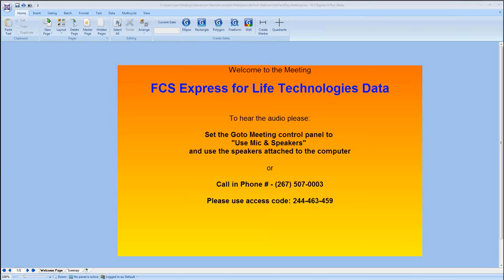So what I wanted to do today is give you a little bit of an overview about FCS Express, a little bit of information about our company, Novo Software, and then how you can work with data from the Attune in FCS Express. Because there are some things I noticed with the Attune data: it is on a 7-decade log scale, so sometimes scaling that data can be a little bit difficult in some pieces of software.